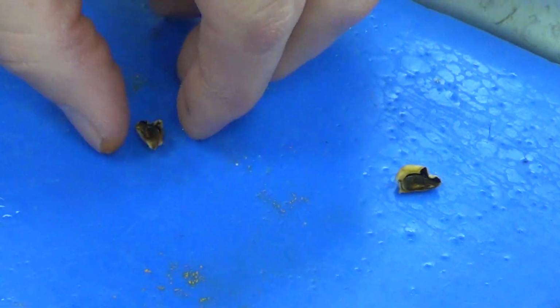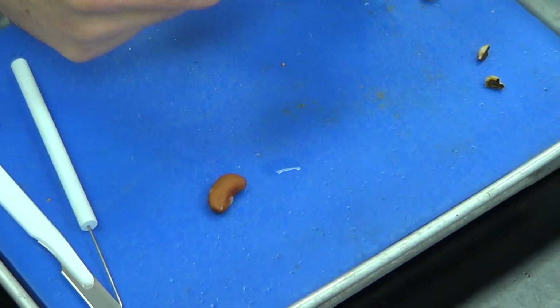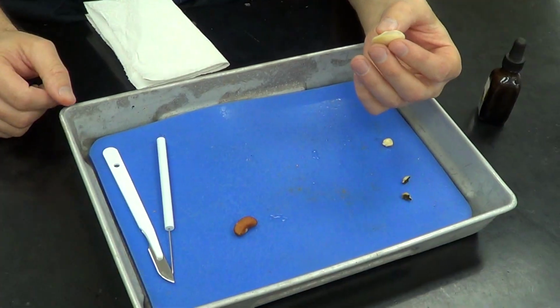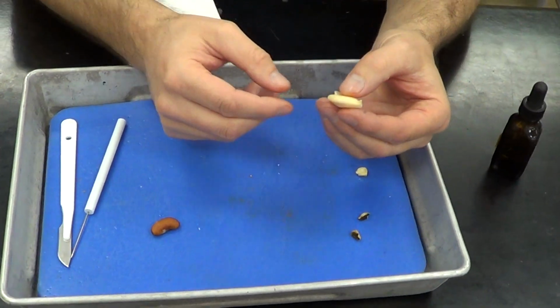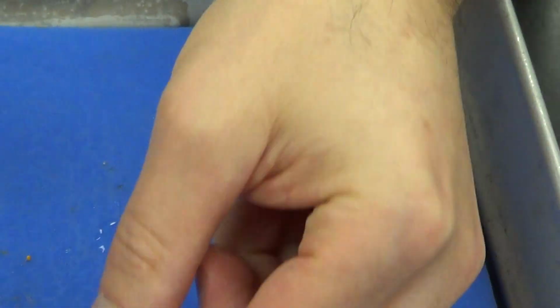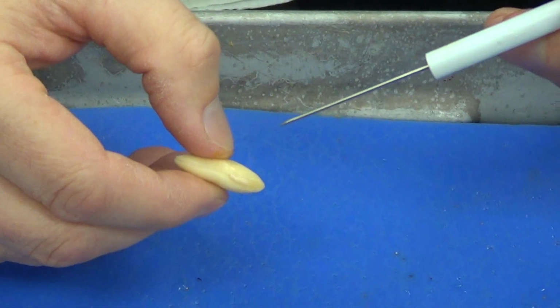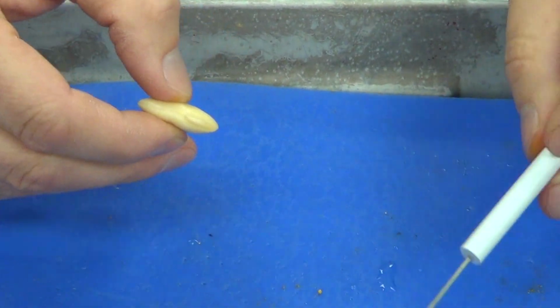Now, let's go ahead and move on to the dicot seed. I'm going to start with the lima bean first. Now this has been soaking for about 8 hours or so, so it comes off pretty easy. You can see that just by moving my fingers the seed coat is literally falling right off. So that's the seed coat. I'm going to put that aside, and then very gently, if I point right here, you can see a little bit of the embryo sticking out, and we don't want to damage that. We want to try to keep that intact.